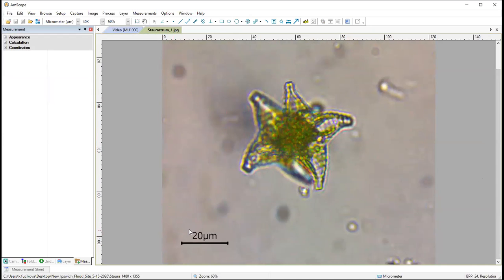But once I've put it in, you see that I can no longer move this. It is permanently part of this image. So that's good. Having this saved is a good product. It will take a little while to get used to this workflow. You'll probably want multiple images of every specimen, and that's fine. I'll explain how you want probably different genera from different views so that you have the maximum information for this.